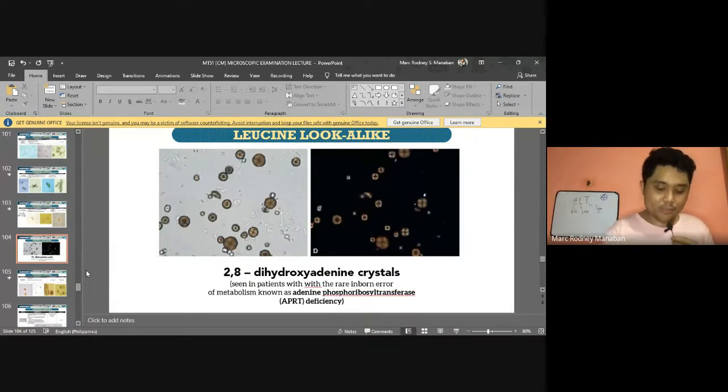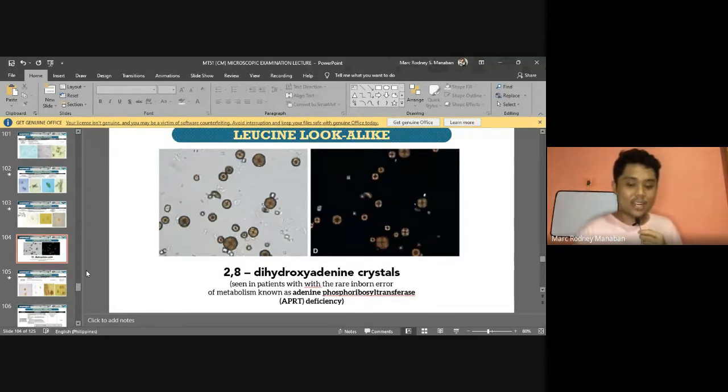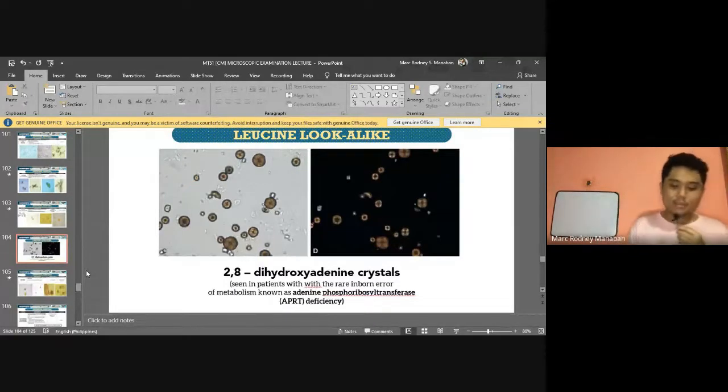Next, you have a possible look-alike of leucine. It's no longer in your notes, dears, but again, I will post it. We have what we call the 2,8-dihydroxyadenine crystals. It is seen in patients with the enzyme deficiency adenine phosphoribosyl transferase, APRT. If APRT is deficient, it can affect the kidneys and urinary tract, and can lead to the production of kidney stones. So patients with APRT deficiency have a higher risk of forming kidney stones. And again, that's a possible look-alike or misidentification error of leucine, your 2,8-dihydroxyadenine crystals.